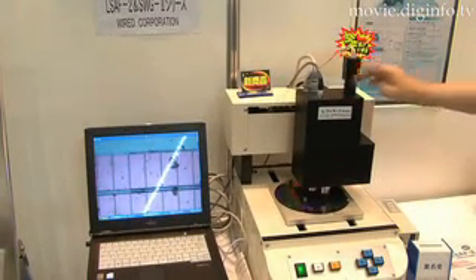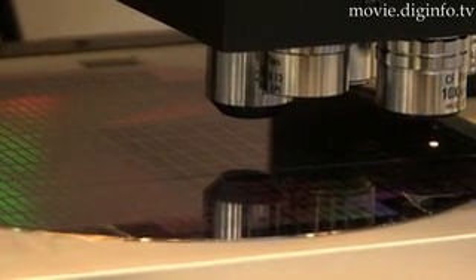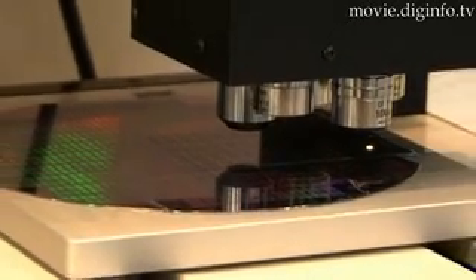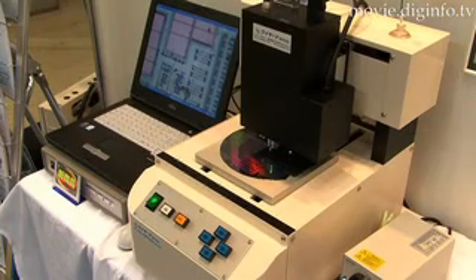Even if the sample is disturbed and focus is lost, this microscope can regain focus quickly. With an all-in-one unit which includes an AF unit, light, a pulse-motor controlled electric revolver, and focus stage, margin of error is greatly reduced.